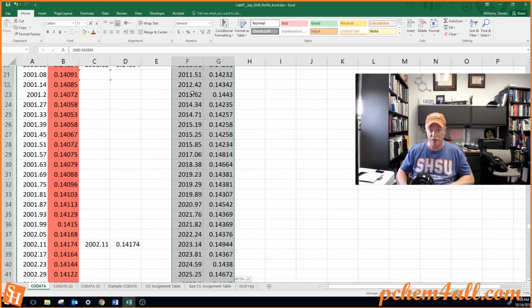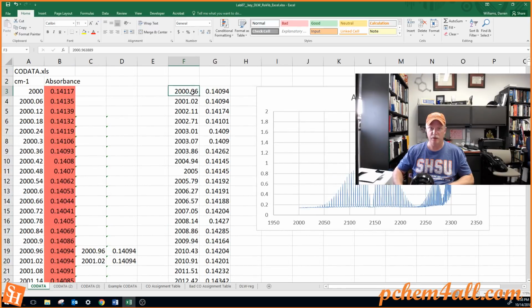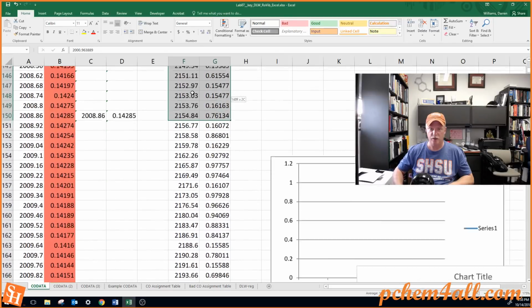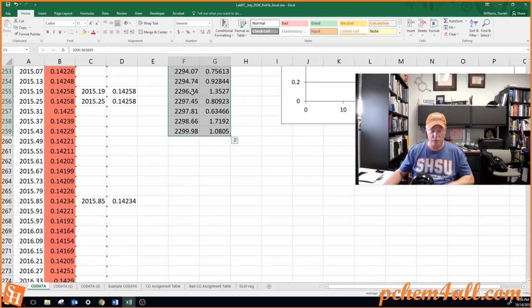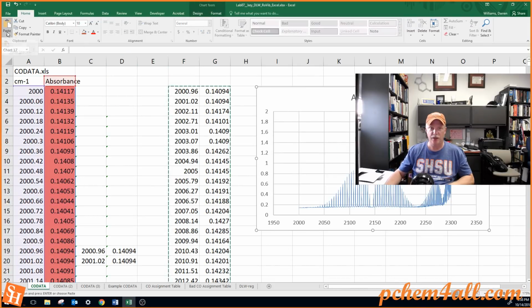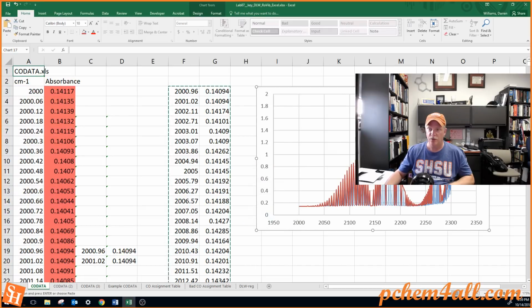Let's go ahead and plot this. Actually, we don't need all of those blank spaces, so let's come down here and just plot this data here. I'm going to copy that data and click this chart and hit paste special. New series. X categories are in the first column. Hit go. And then I want that data set to be markers only.